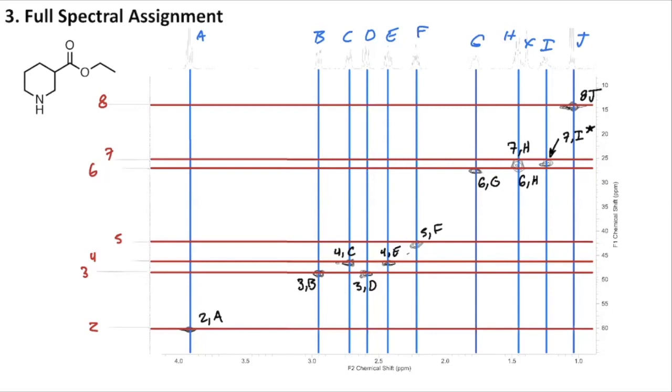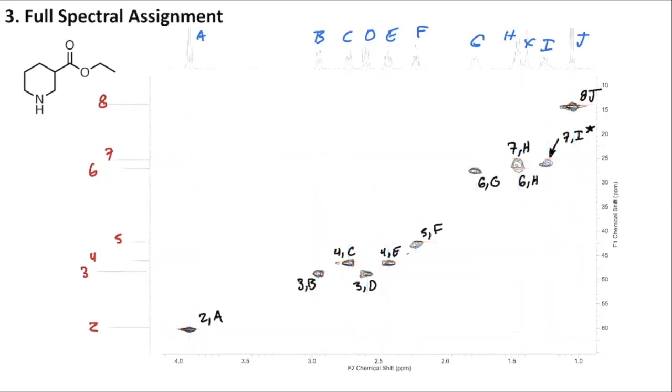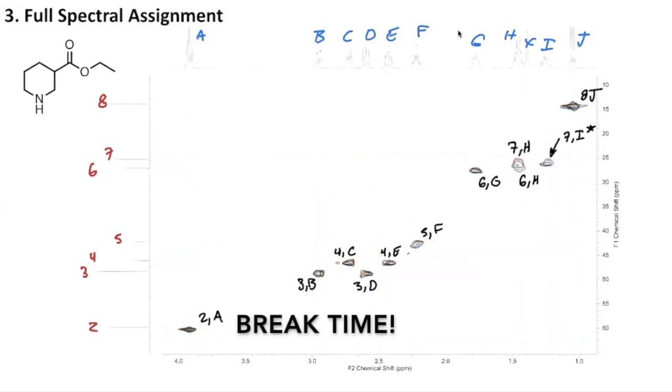Okay, so again, removing these lines now that we're done using them, and we can just tabulate up this data later on. Feel free to take a break, think this over, and come back to it. All right, so with that, we've put some correlation labels on all of our 2D NMR data. We have kind of parsed through as much as we can.